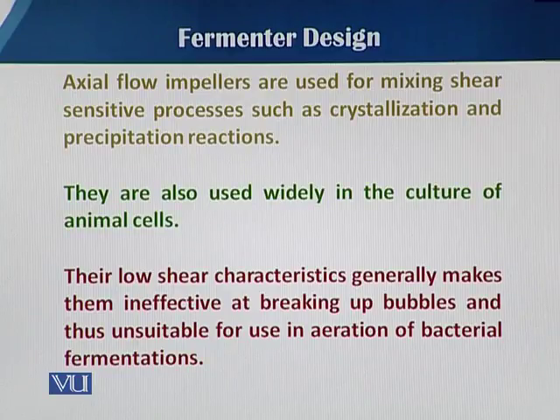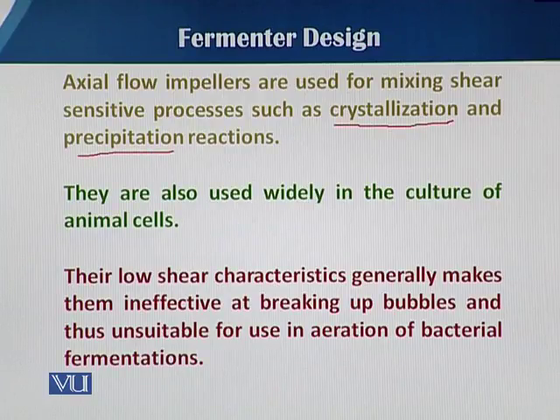Because sometimes the product is based upon crystallization and precipitation, and there is a chance of breakdown of those crystals, we cannot use the radial flow impellers. So that's why we use the axial flow impellers.